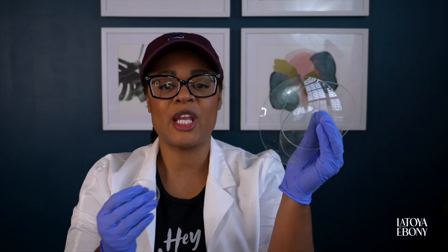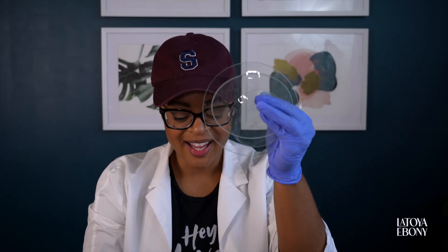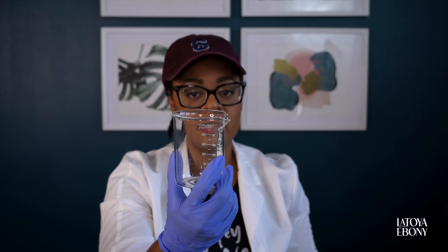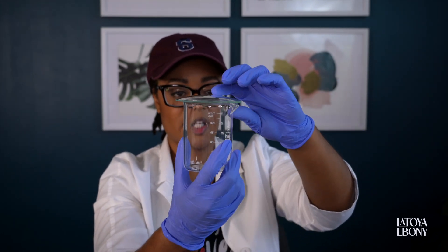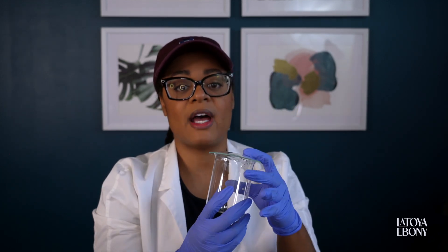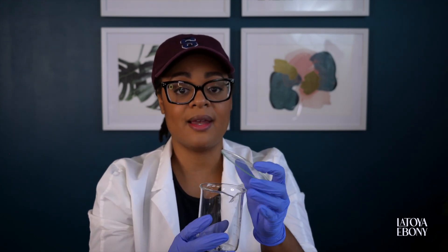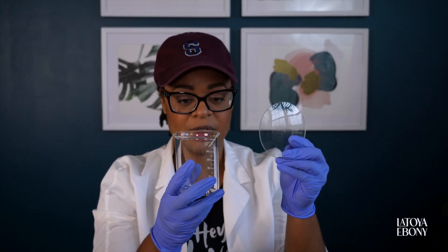I ended up purchasing watch glasses. I believe these are actually made to go on watches, but they're really great to cover your beakers, especially if you are using liquids that evaporate. You're heating water in your beaker and it's evaporating — you want to stop that. So you put a watch glass on top to lessen the amount of water evaporated, so you don't have to worry about your percentages being as off.